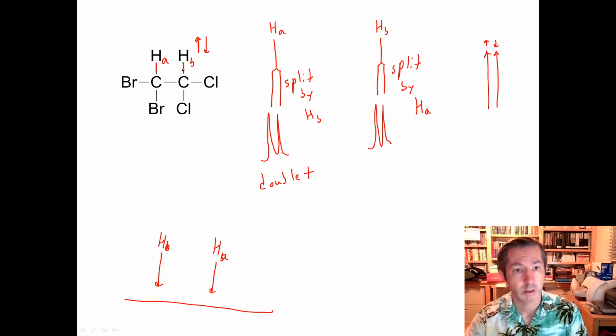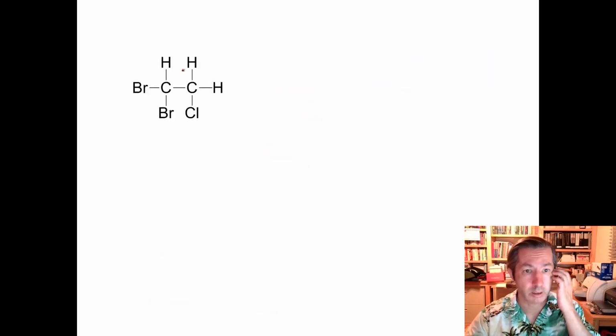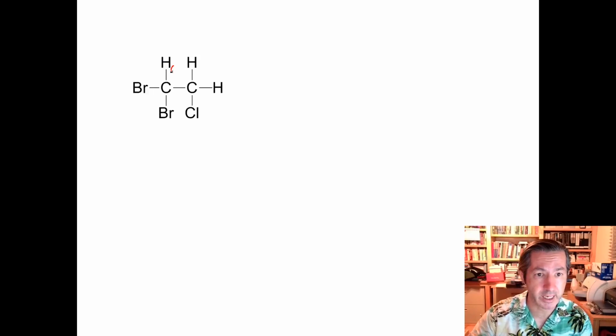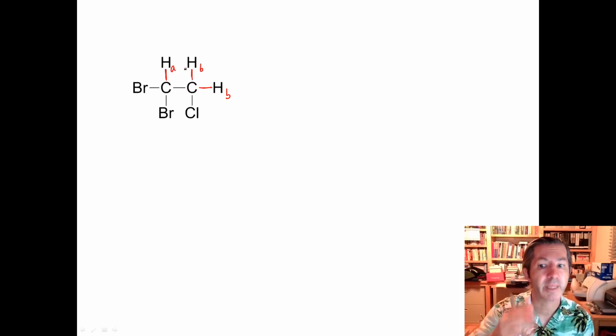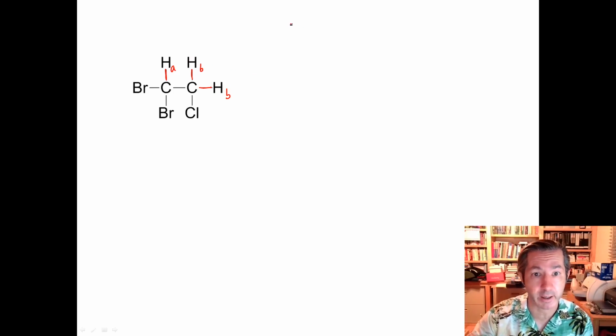So let's take a look here. So we have HA again. HB meets someone and they move in together. And so now HA lives on this carbon. HB, this couple here, they live on this carbon. So they are neighbors. So HA has two neighbors. HB, they have one neighbor. So here's what's going to happen to HA now.